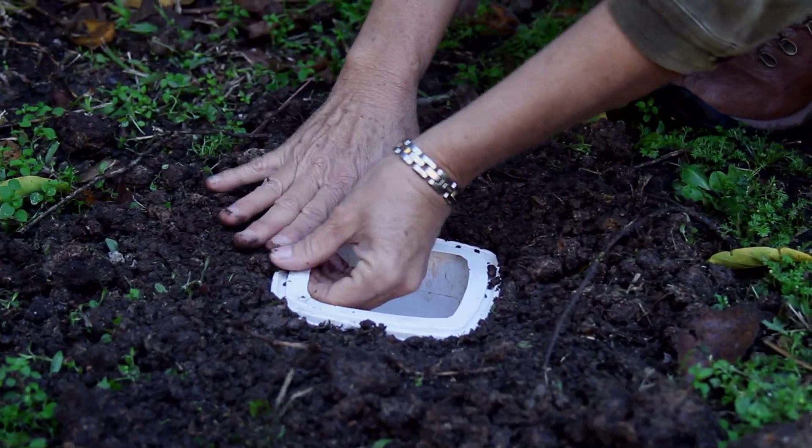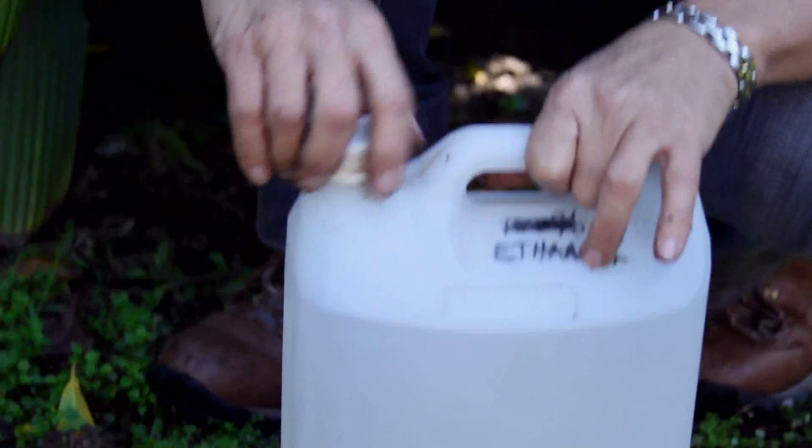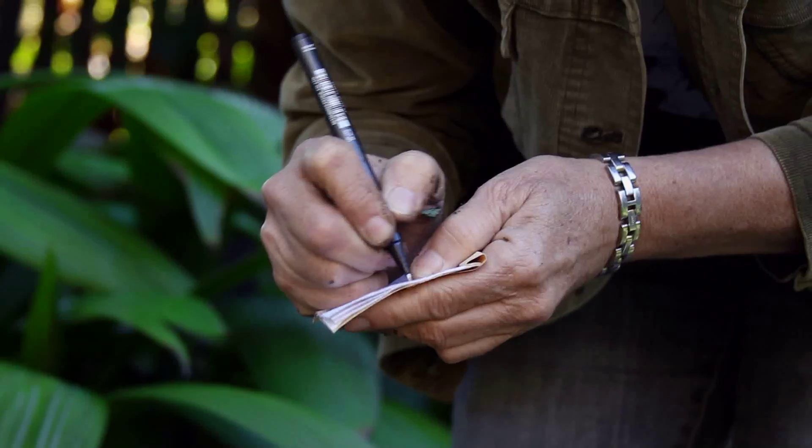You then fill the little groove with soil. Then you add a preservative and a label to your pitfall trap. That preservative could be metho, ethanol, or water with a drop of detergent if you are using a short term trap that is up to a couple of days.